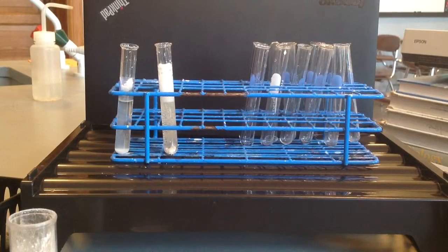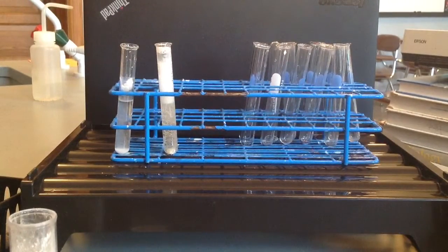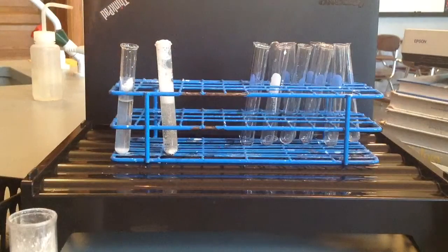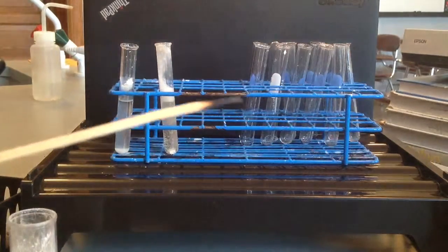Okay, time for the burning splint test. I moved it over a little bit because that blue bar was in the way so that you can see a little bit better of what's going on. And it's actually bubbling up pretty good, so I'm going to give it a second to calm down before I do the burning splint test. All right, here we go. Burning splint. All right. There you go.